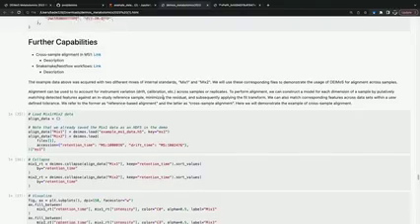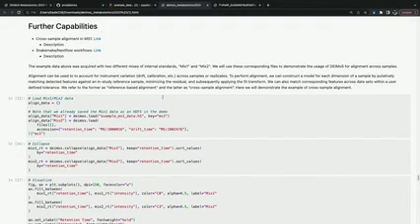There are also further capabilities of DEIMoS. You can perform alignment using DEIMoS. DEIMoS is designed to be integrated into larger workflows, and we've developed several workflows at PNNL that integrate DEIMoS into, for instance, a larger Snakemake workflow where you can perform a variety of those functionalities. Snakemake and Nextflow, for instance, can scale very well to HPC resources or cloud. So if you have very high-throughput data processing needs, DEIMoS is designed to integrate fairly well into those.